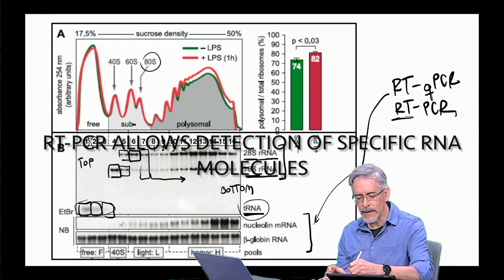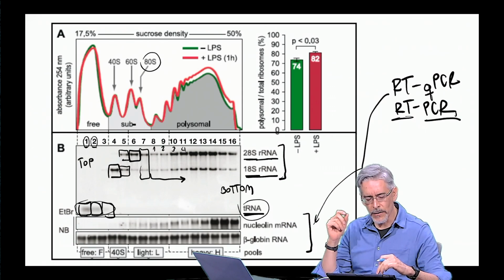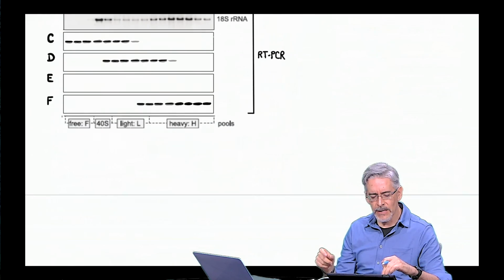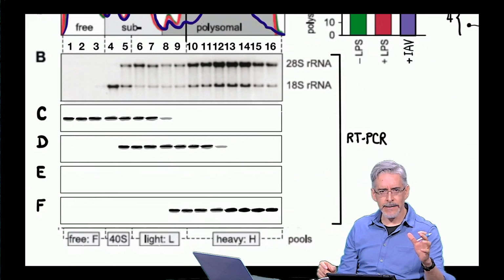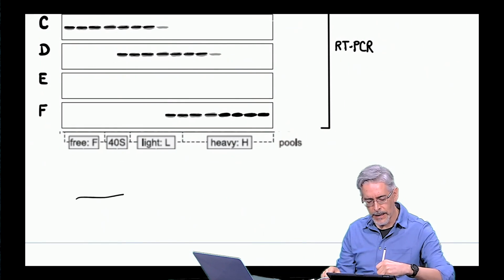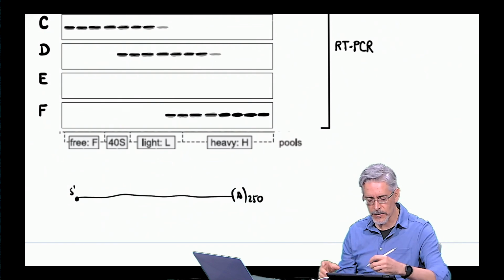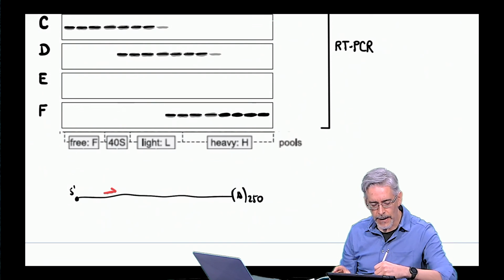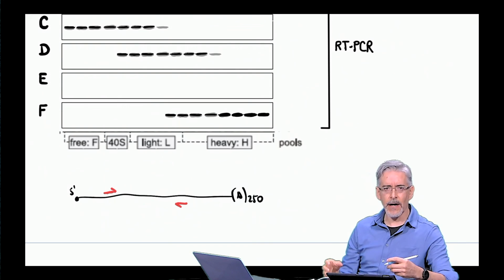So RT-PCR is reverse transcription PCR amplification. So when you're looking for specific messenger RNAs, you can have specific sets of primers that will target a specific messenger RNA. So if, say, you're searching for the messenger RNA that codes, for instance, for tubulin, just to give an example, you will have a forward primer and a reverse primer that target sequences that are specific to tubulin.